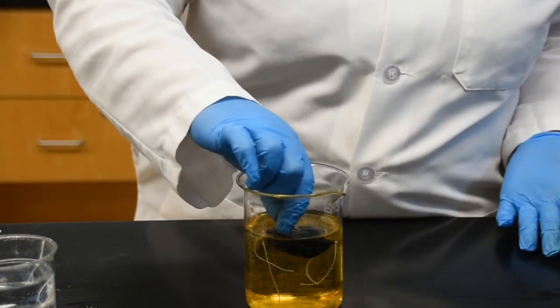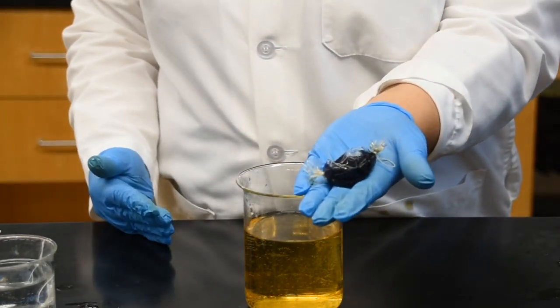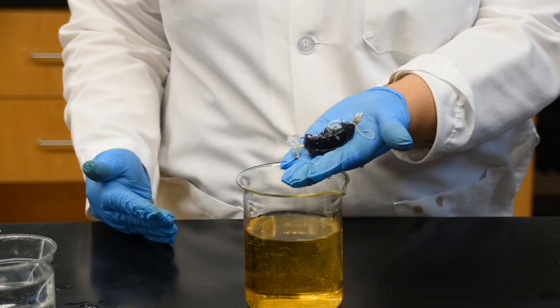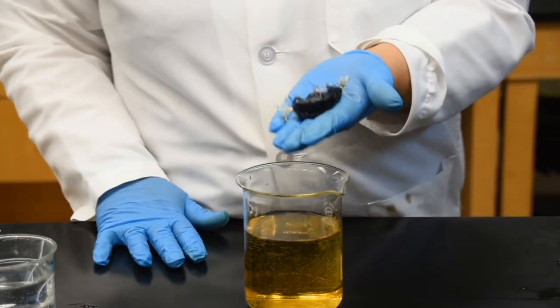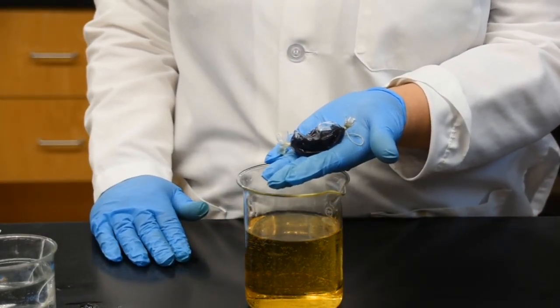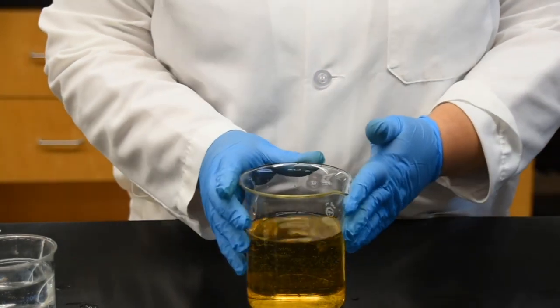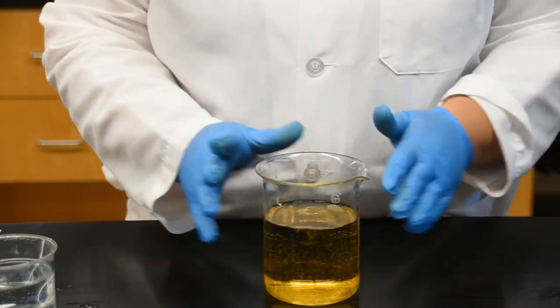So right here, I have completed the experiment. Here is our baggie. You can see that our baggie went from that cloudiness to a bluish black color. So in terms of the color of the starch bag, for the final you can write black or bluish black. I have taken a moment to weigh this bag before, and the current weight is 23.2 grams, which means the weight has increased. And lastly, you can see the color of the beaker remains yellow, so there is no color change in the beaker.